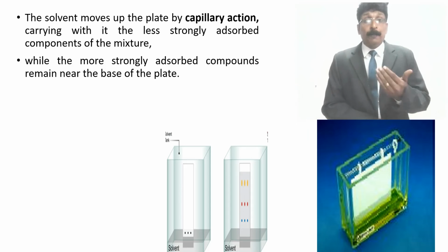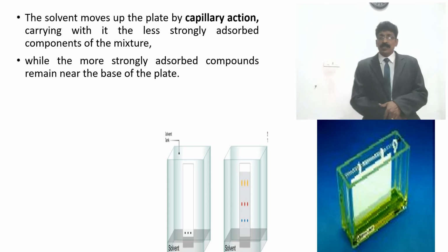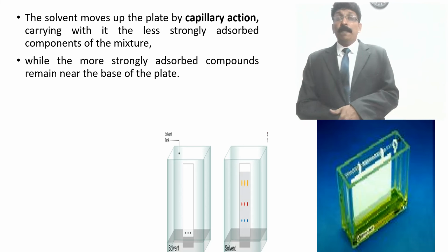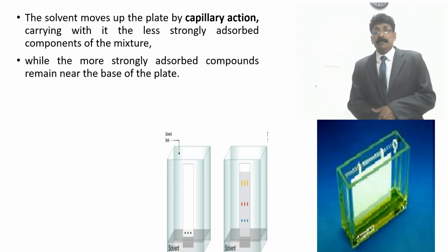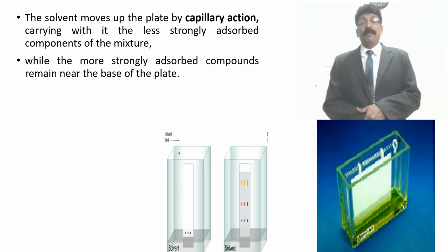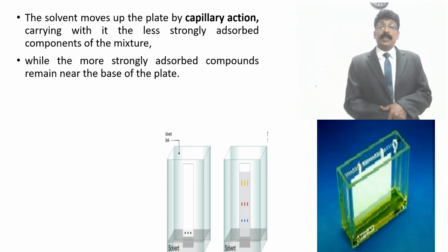And also you should know that if you have a solid stationary phase in the thin layer, TLC works as adsorption chromatography. The adsorbent which you made in the thin layer may be silica gel, alumina, or cellulose. Usually we have the thin layer, which is solid in nature, and the mobile phase will be the solvent, so that it works as adsorption chromatography.